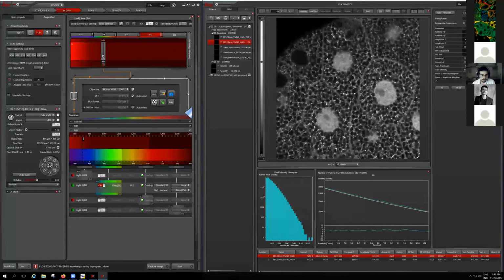So I was talking about that. The chi-square is not the only parameter. So I'm not saying that you should fit your data with any chi-square. If the chi-square is 100 or something, that's a lot. But 18 as well, that's usually not what we see here, and that's because I have not discarded the nuclei. So usually I get something between 1 to 4 or 5 for the chi-square.